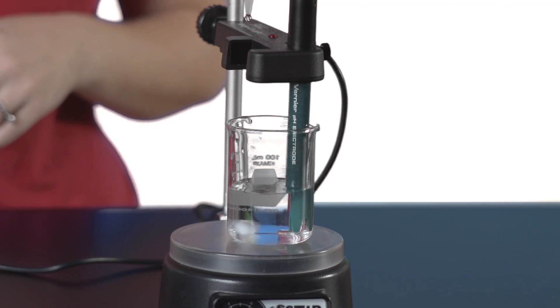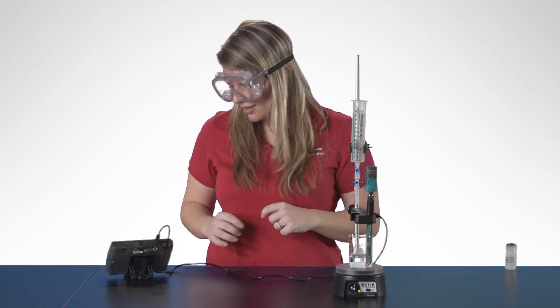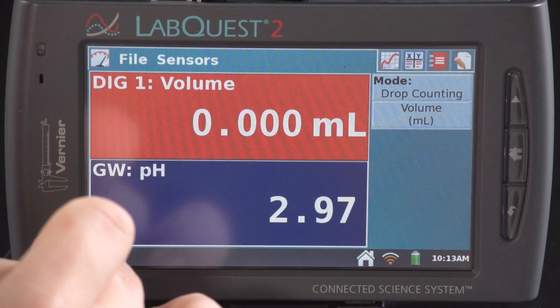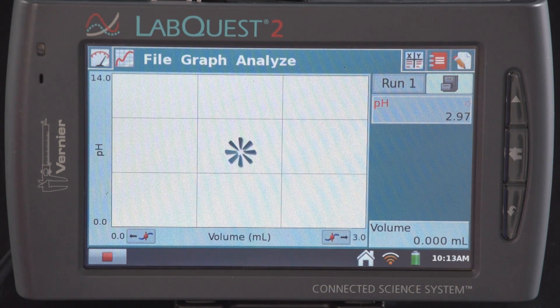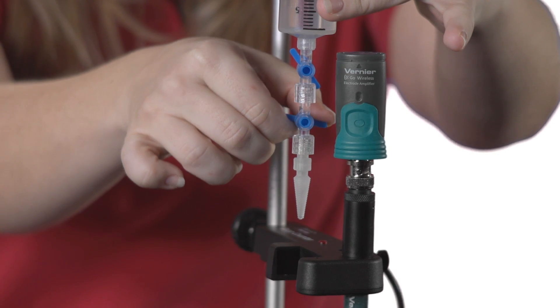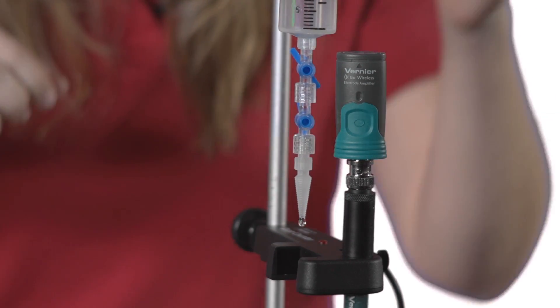We also want to make sure that the bulb of the PH electrode is completely submerged in the solution. Now I'm ready to start taking data. I'll tap on the collect button on the LabQuest 2 and it's waiting for the drops to come — nothing will happen until I start sending drops through the drop counter. So now I'm going to open my burette and let the drops come in at about one drop per second.